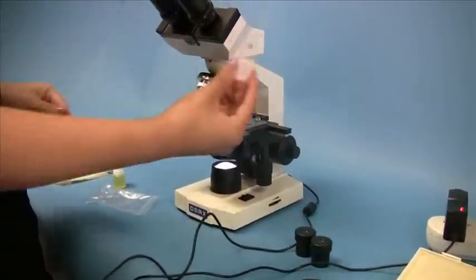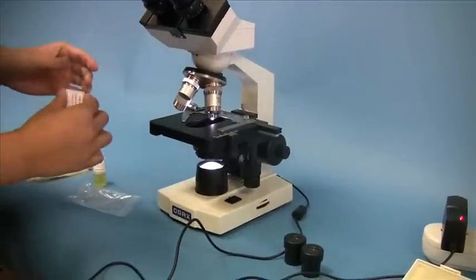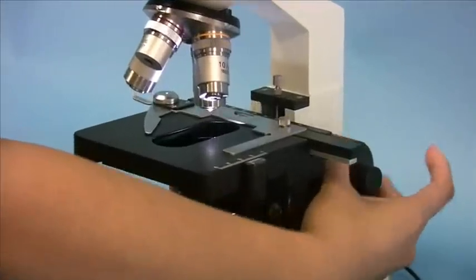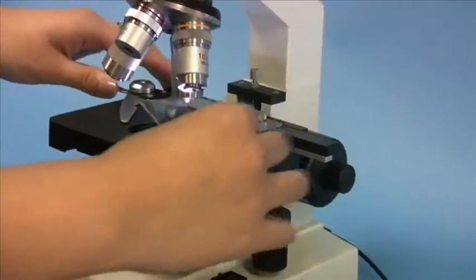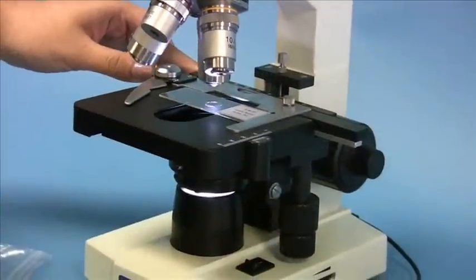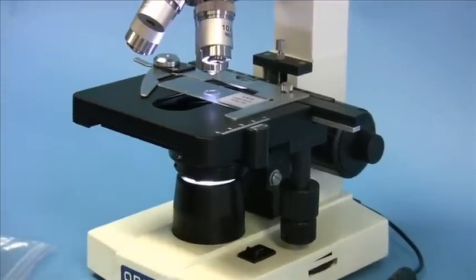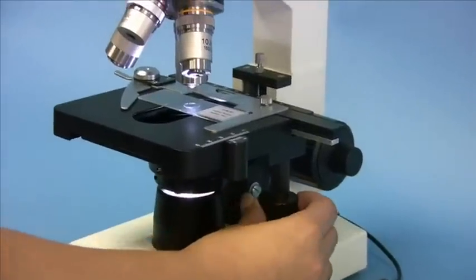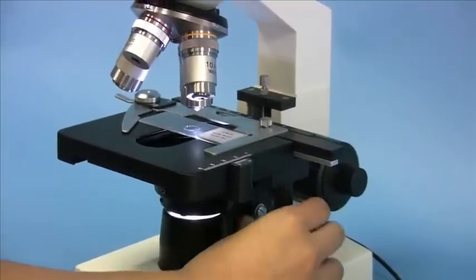So let's take a slide. In order to place it, first you want to lower the stage to its minimum height using the coarse focus adjustment knob. Place the slide on the stage and gently secure it using the slide holder. You want to make sure that the slide is placed right underneath the objective by using the x and y adjustment knob.